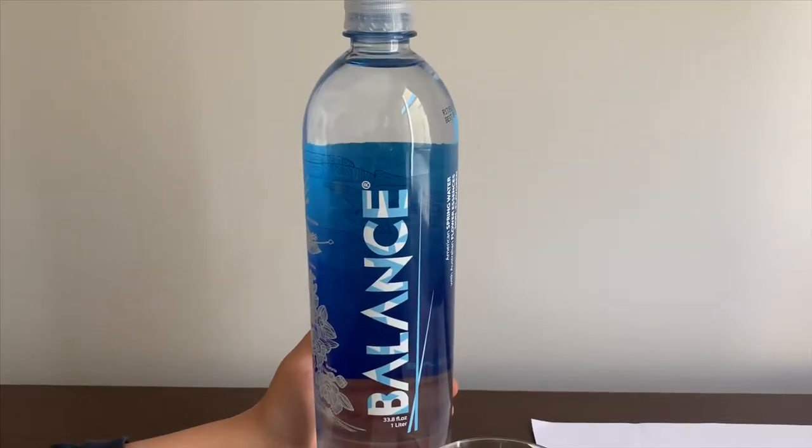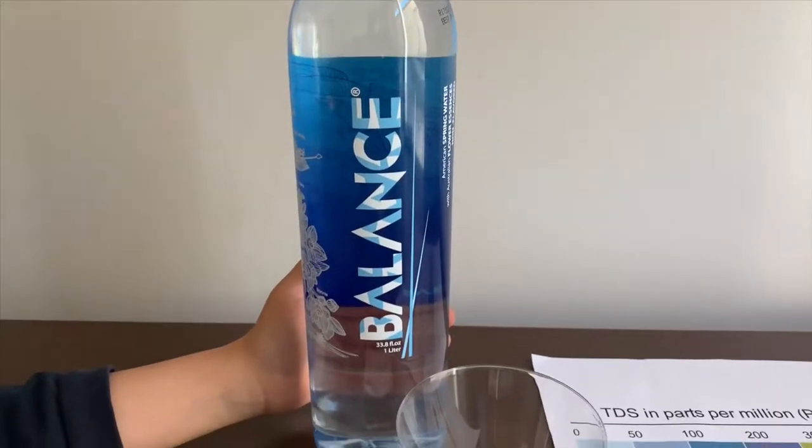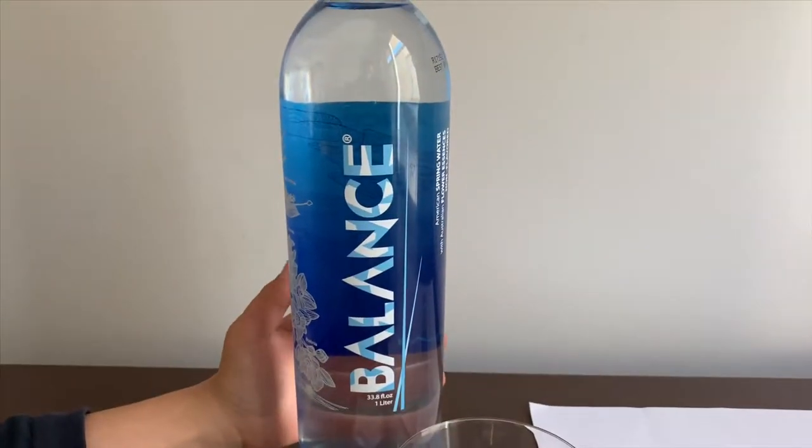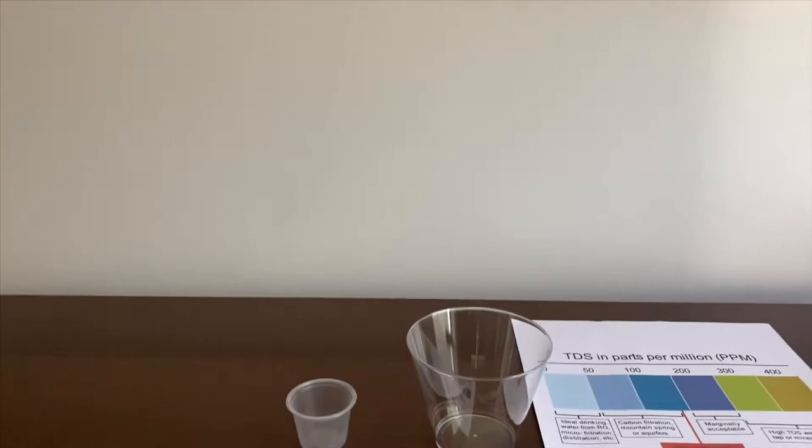This is Balanced Spring Water. It's sourced from Alpine Springs in New York State. Let's test the pH and TGS levels. It costs $2.29.